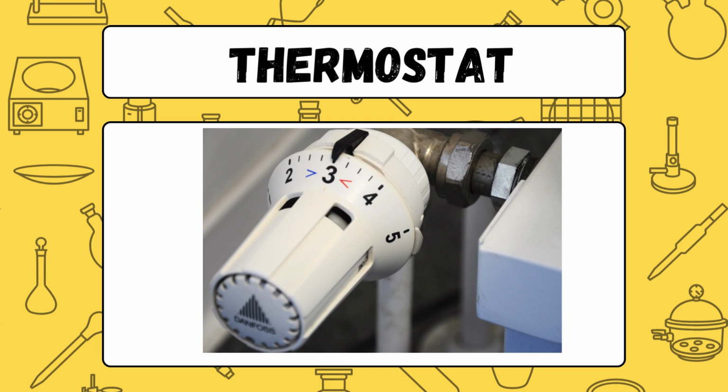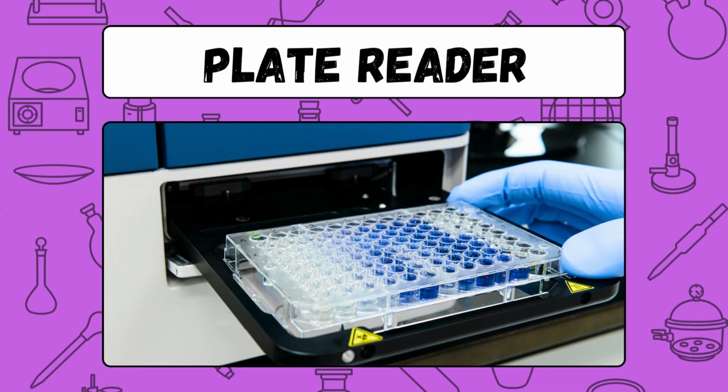Thermostat. A thermostat is a device used to regulate and maintain a set temperature in a system or environment. Plate reader. A plate reader is an instrument used to measure absorbance, fluorescence, or luminescence in samples contained in microplates.